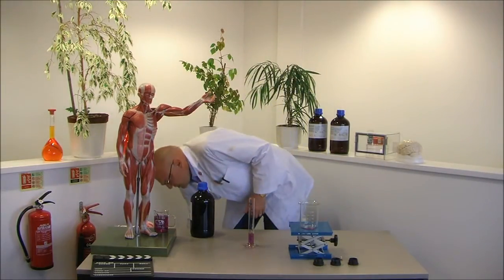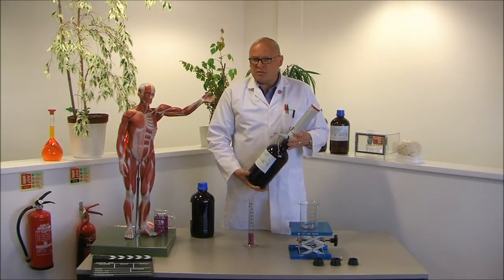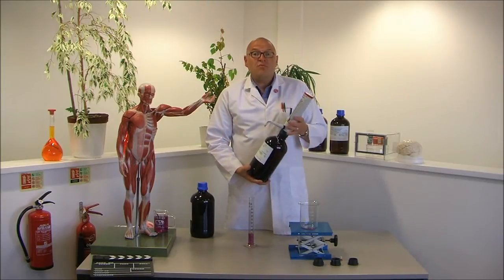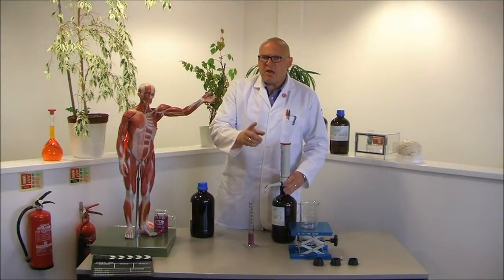In fact, let me show you this wonderful new product. It's from Swiss manufacturer Socarex. It's a bottle top dispenser available in 25ml, 50ml, and this, the 100ml variable volume version. Let me show you exactly how it works.